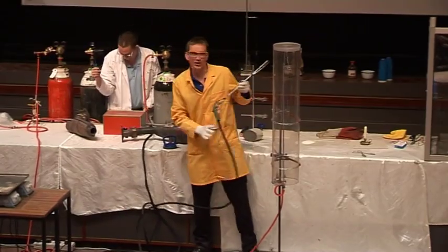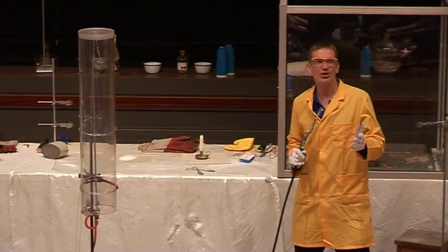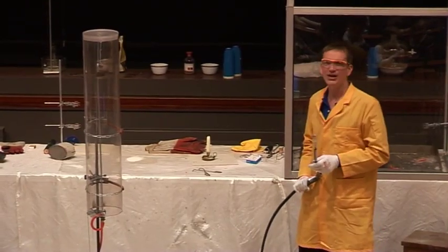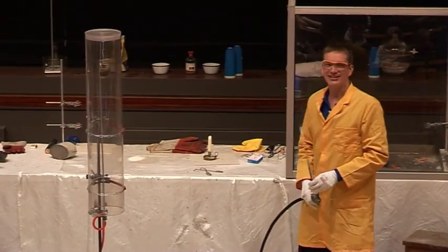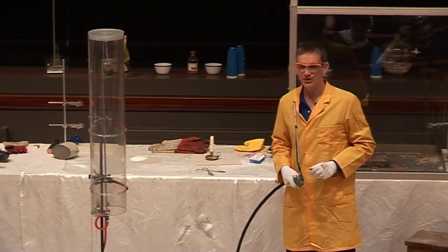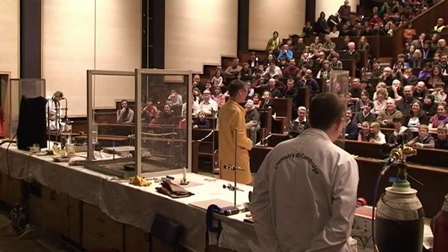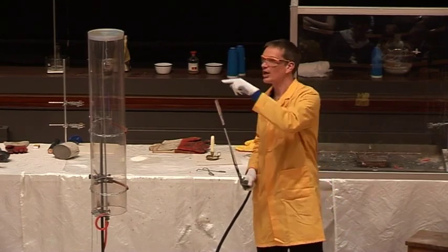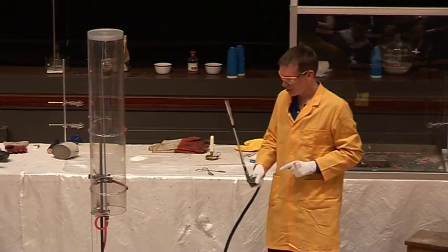And remember how we couldn't light the oxygen gas? Well, we can't light oxygen in the air because oxygen doesn't burn in air, but can I light it inside the hydrogen? Right, this is slightly nerve-wracking. Okay, now there's a little electrical spark on the end of this, so when we're in place, Mark, not before, we can start this sparking, and we're going to let the oxygen come out, and it should light inside the hydrogen here. Okay, so remember, oxygen doesn't light normally.